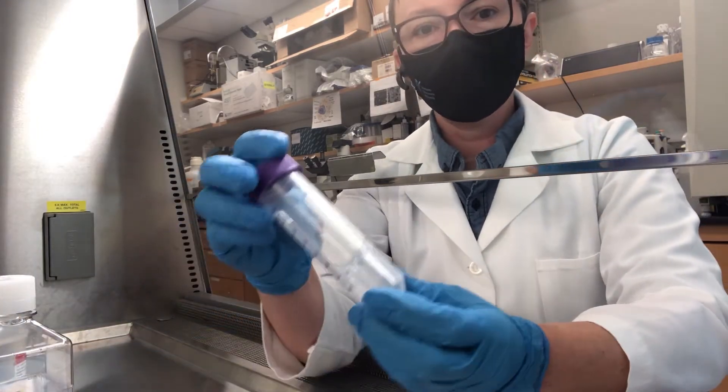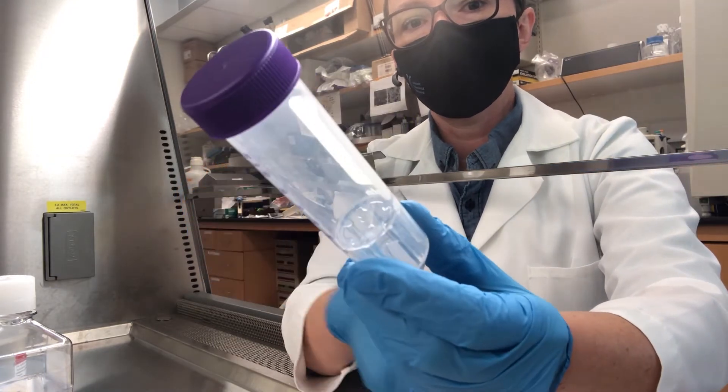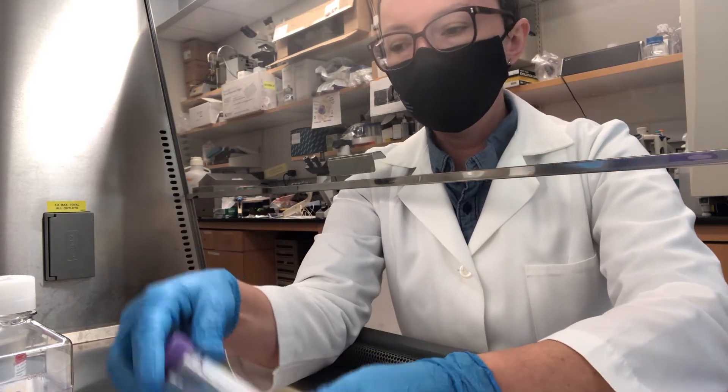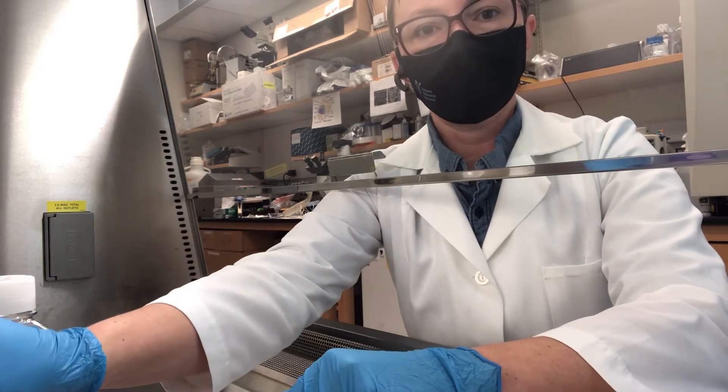These tubes might look a little bit like a normal 50 ml conical, but if you can see on the inside there, there's a plastic insert that has a small hole in the center, so it's a little bit like a funnel. These tubes are going to make it a lot easier to remove the red blood cells.